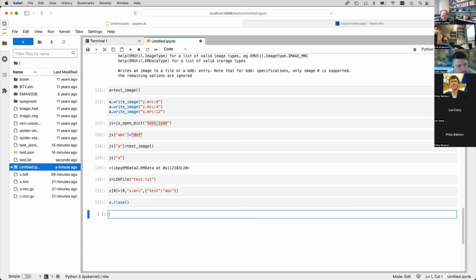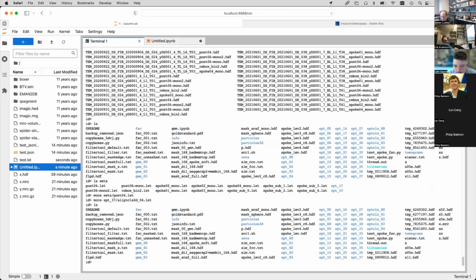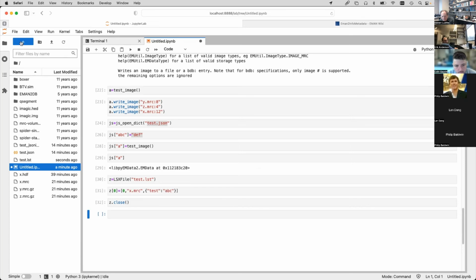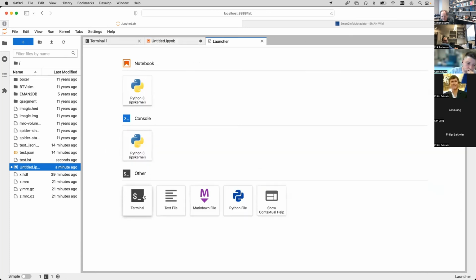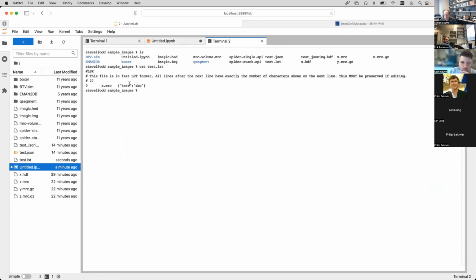Just to make sure, it actually shouldn't be necessary, but I'm just being extra careful. Oh, sorry, I'm in the wrong folder again. So now you can see we have a test.lst, and it's properly formatted.